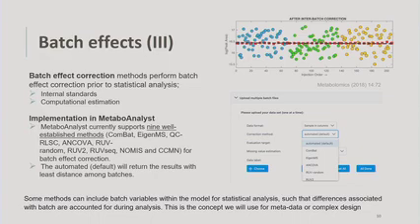There are many different batch effect correction methods. I'm not going to go over them in detail, but MetaboAnalyst does have a batch correction module that you can use to use a bunch of them. It's separate from the main workflow. There's kind of 2 different classes of strategies. One is to actually adjust the data itself, so to actually perform an adjustment on your omics, your metabolomics matrix.